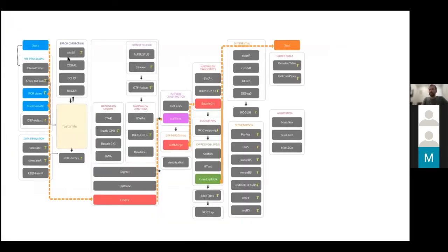And when you start, you essentially load the data into your pipeline. That data could be of many different formats and many different types of sequencing. So you have different protocols, you have different types of sequencing like pair-end and single-end. You also have different types of read lengths, and you have different amount of reads for the whole sample. So you can have millions of reads, but you can have 10 million, 5 million, 3 million, right? So different coverage. So pair-end and single-end, different methods of data preparation using different library preparation techniques, different sequencers that produce different lengths, and ultimately you have also different genomes.